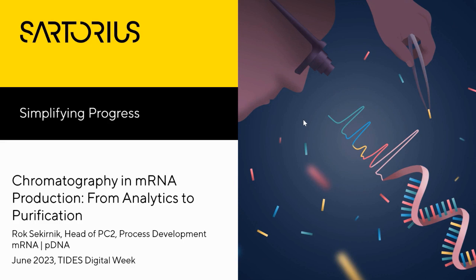And in the next 45 to 50 minutes or so, I would like to give you a breakdown, step by step, through the steps of the mRNA process, how we speed up process development, and how we optimize individual steps, starting all the way at the beginning, which is, of course, the production and purification of plasmid DNA.